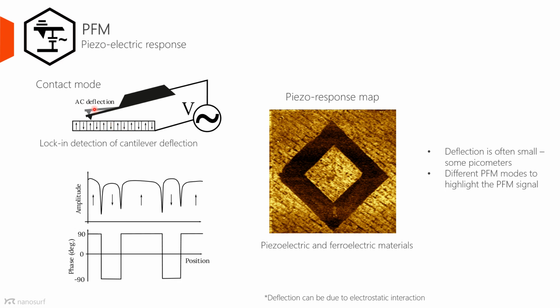amplifier. If you have piezoelectric domains in the sample, let's say oriented in and out of plane, you would see a similar signal amplitude for both domain orientations, but the signal phase will undergo a 180 degrees flip, and the domain walls would show as dips in signal amplitude.